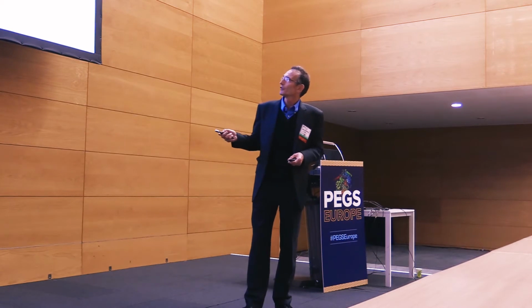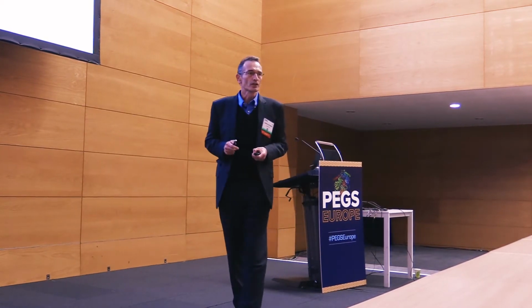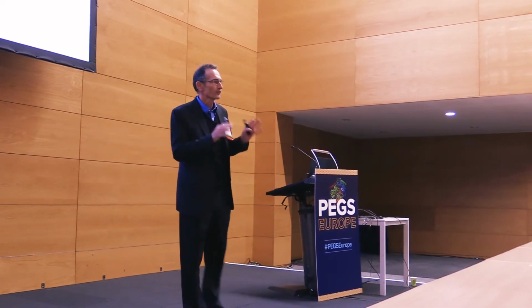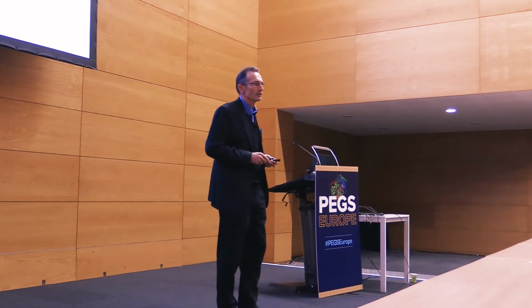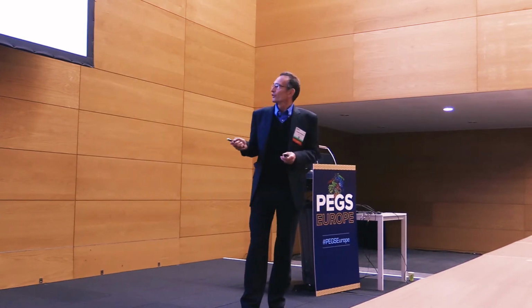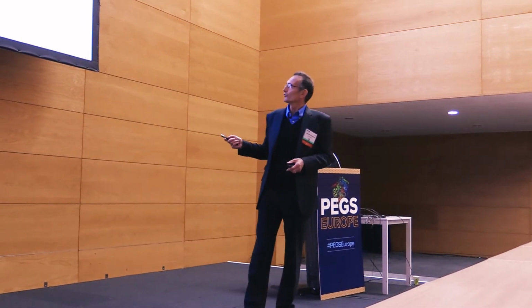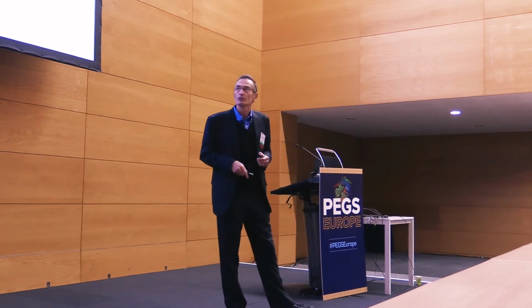And then finally, what I'm going to talk about today is generation 3. And this is a new synthetic concept where what we've done is we've taken natural CDR sequences, we've embedded them within therapeutic scaffolds, and then eliminated all the sequence-based liabilities in order to essentially improve the quality of the antibodies that come out. NGS was also used throughout for quality control and also for diversity measurement.